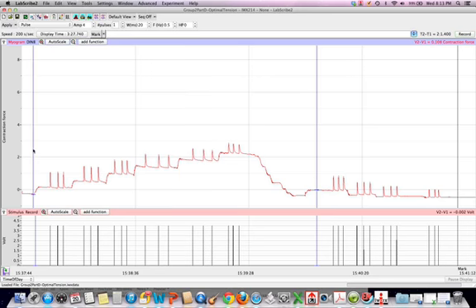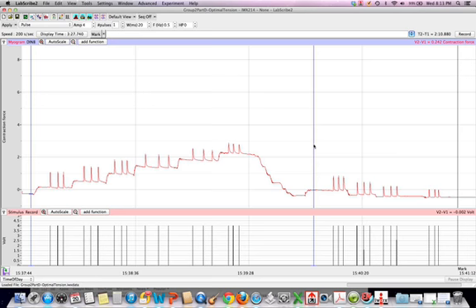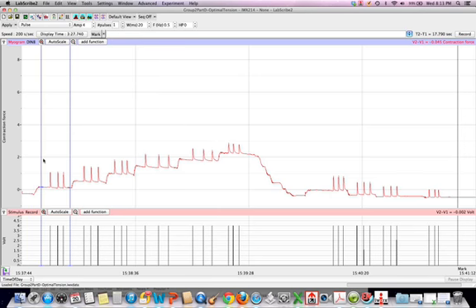and show you what would happen with length-tension relationship. So the thing that they're asking for and they're demonstrating here is that we've changed the length, the amount of passive tension that's being applied to the muscle fiber. And you're going to want to measure the peak of each of these different peaks that you have here. If you don't have 3, if you just have 1, then just measure what you have.